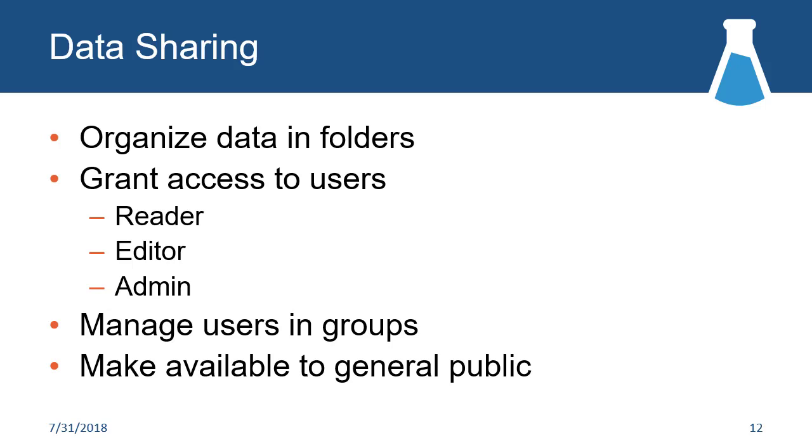So you can say, okay, I want a collaborator from another lab to have read access to this particular folder within Panorama, or I want someone that's working at the bench next to me. They're a full-on editor, and then maybe there's someone in the lab who's the admin who sets up new folders, or is responsible for adding users or deleting users if they leave the lab.